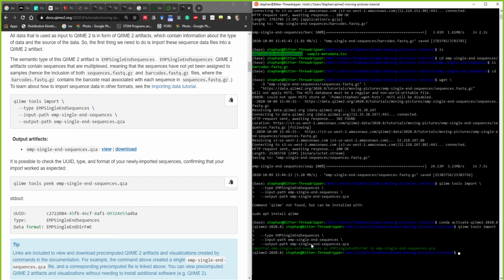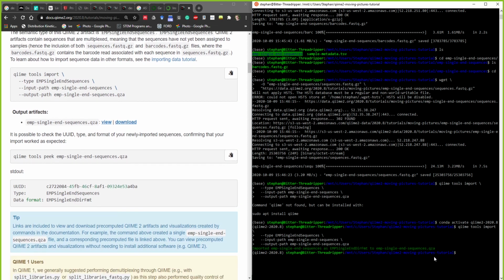Yeah, it just takes a while. That's because this is using only one CPU on your computer, so it's fairly slow when it does these things because it's zipping and unzipping many files and putting them in one place. I think what that's supposed to do is optimize memory usage to reduce how much memory it needs. So it makes it broader and you can use it on many more computers, but it does take more time. Okay, so now we should have an output artifact.